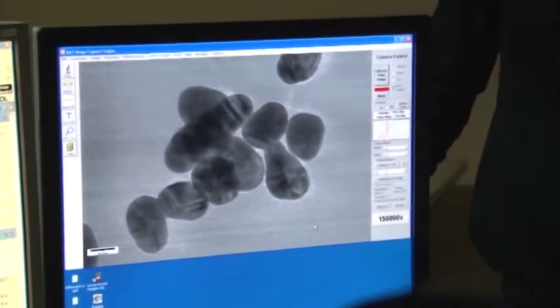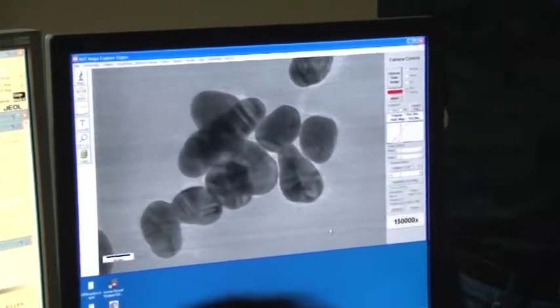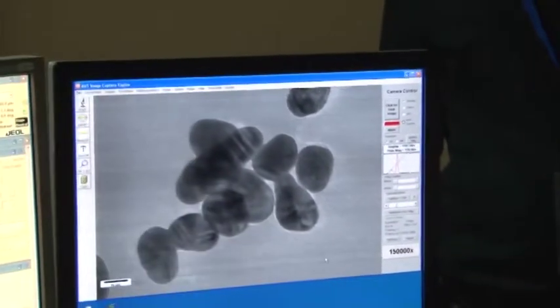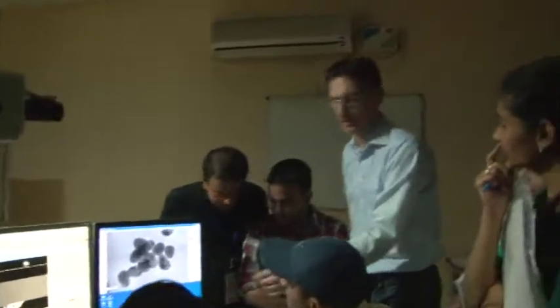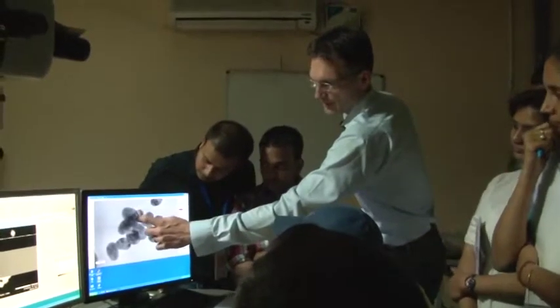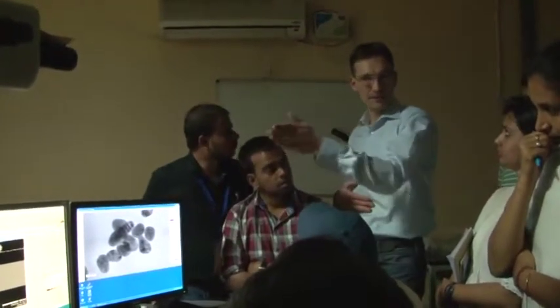I don't think it was so visible, but I don't know why it didn't show much. What you see here, in this particular case, is this white or brighter area. This is some delocalized and diffracted intensity that comes from this particle here. Now we are slightly out of focus, which is why we have this delocalization of image information. So this bright area belongs to that particle, and it's shifted in this direction because it is diffracted into that direction.